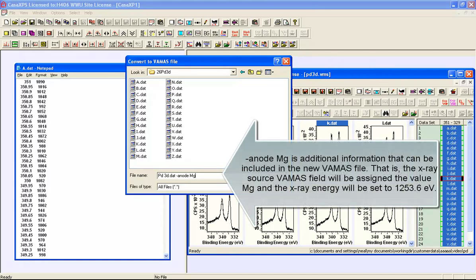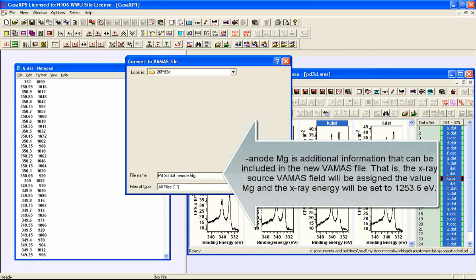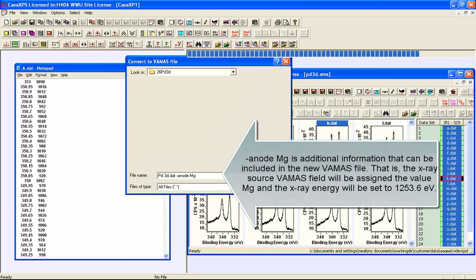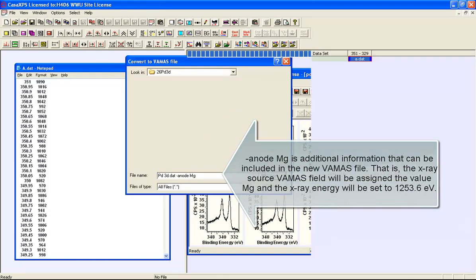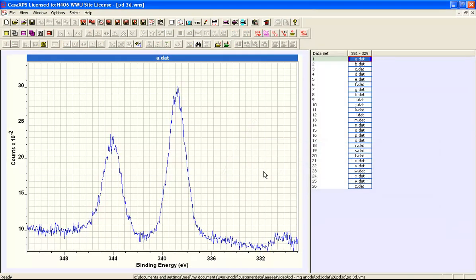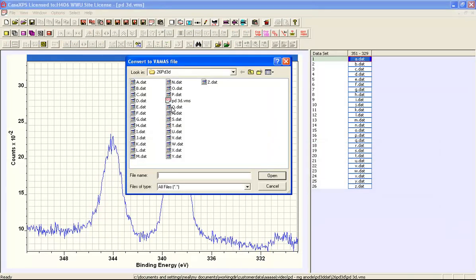When I press open, the directory is read and converted into a VAMAS file and the new VAMAS file is then opened in CASA XPS.